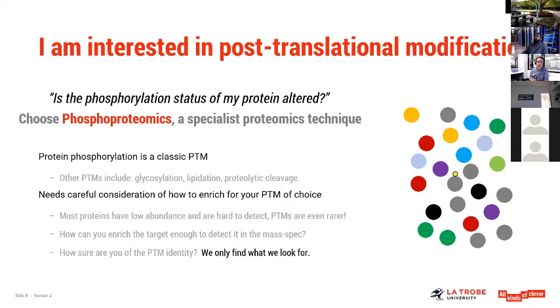basically, do you know what modification you are looking for? Do you know how the protein is modified? That definitely helps us plan an experiment. And this is definitely something where you would 100% come in and have a good sit-down meeting with us to plan the strategy before you get really stuck into your experiment.